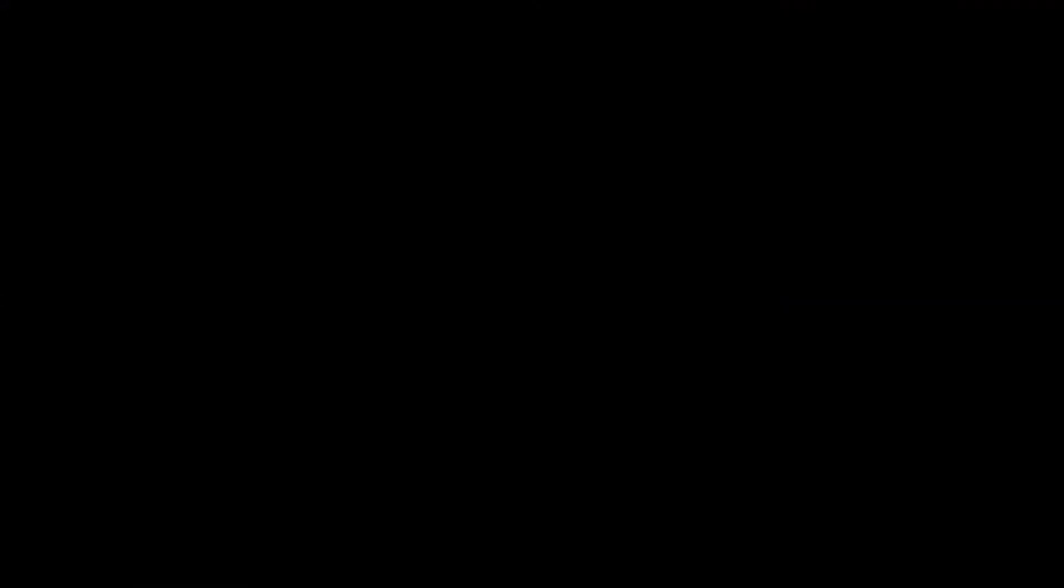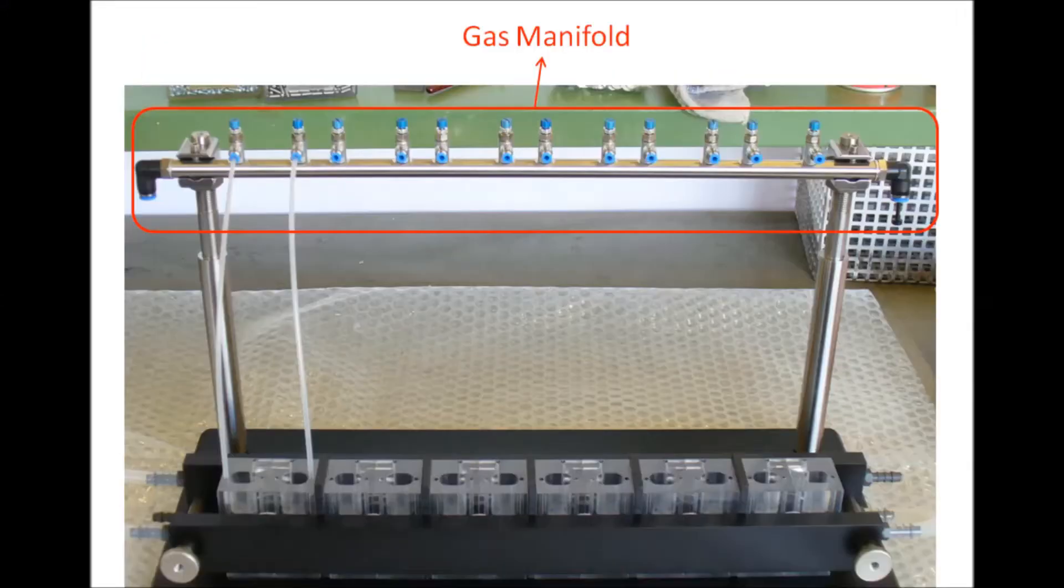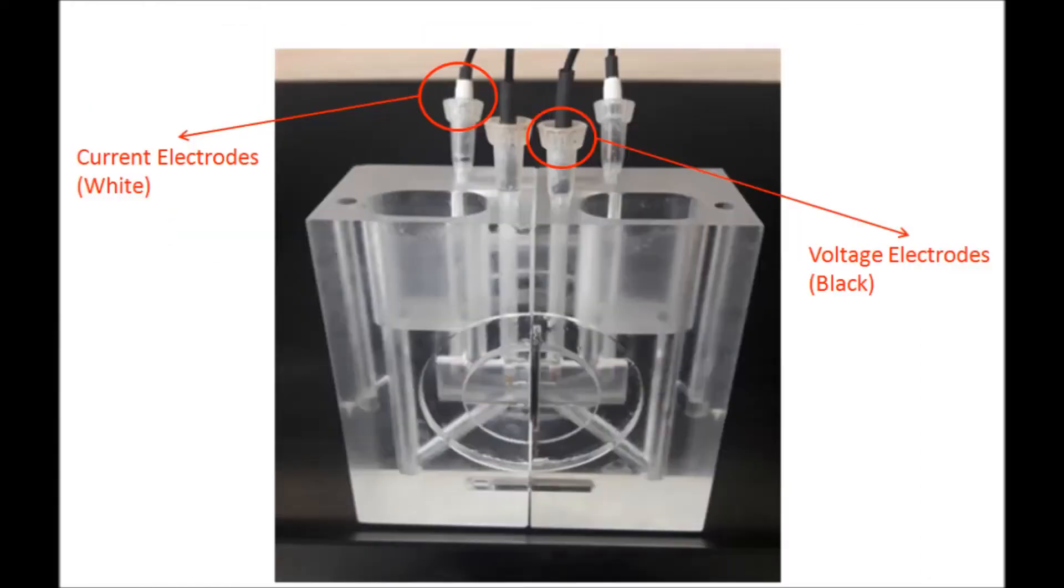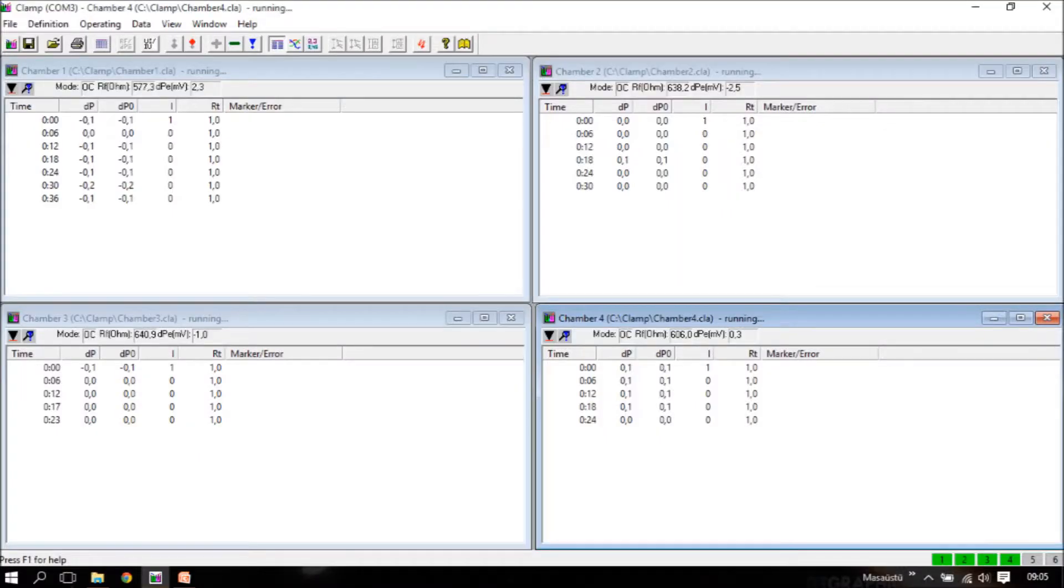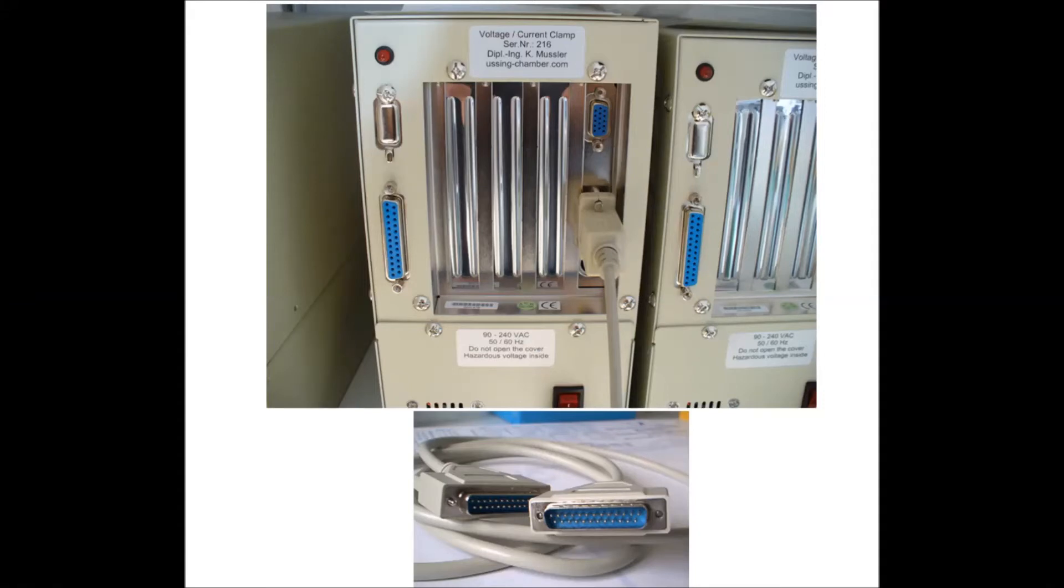The system consists of a heat exchanger, a gas manifold, 6 chambers, current and voltage electrodes, software for the PC, and the data acquisition equipment.